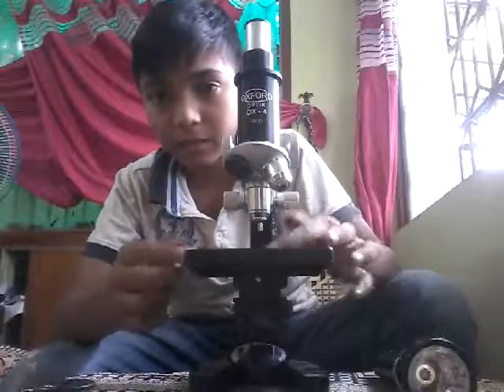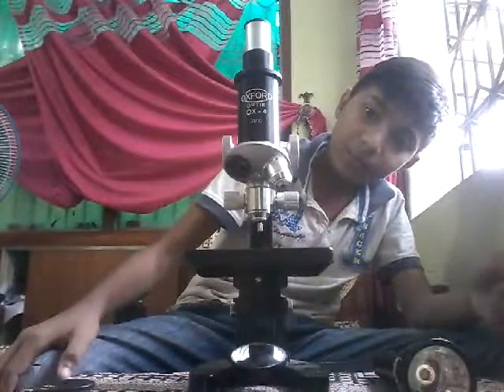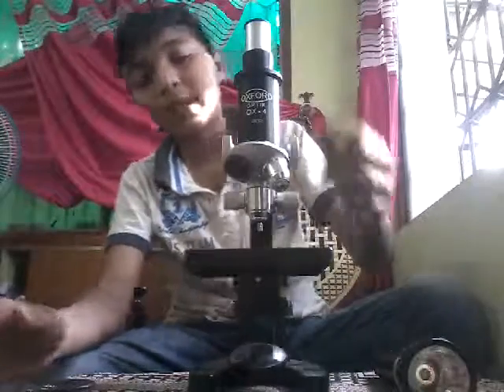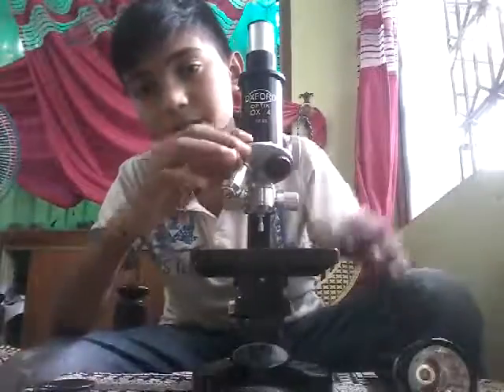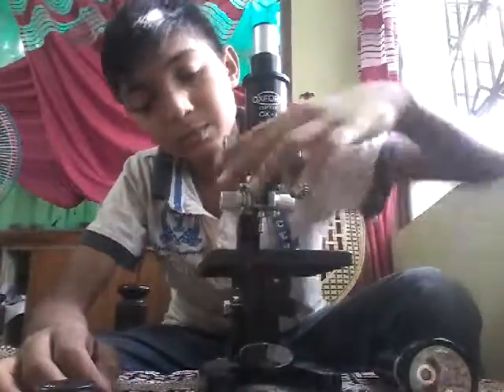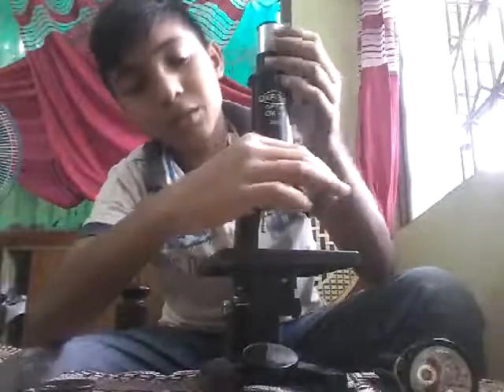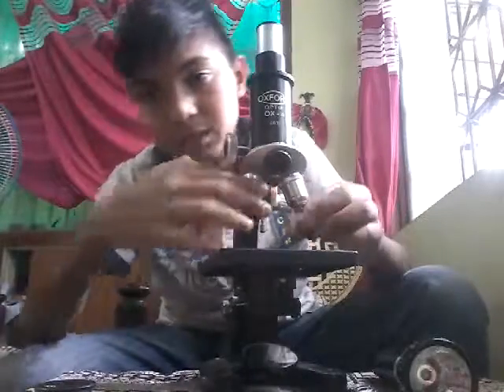And these are the stands, two stands. Here's the eyepiece, guys. You got this? Again, if you want to twist, you can twist it like this, guys. Anyway, I'll show you one thing. Oh, be careful with it, guys.